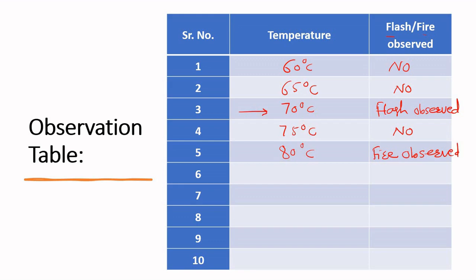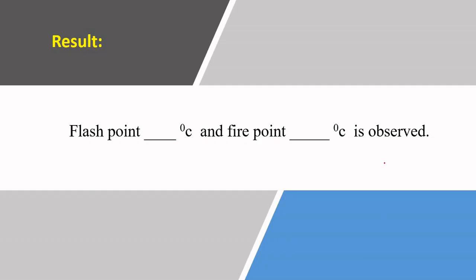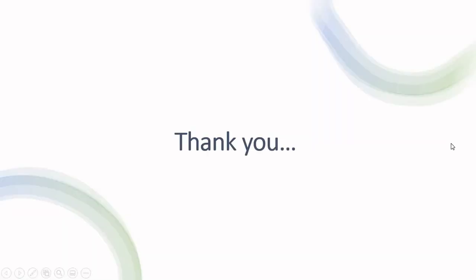This observation gives information about the flash point and fire point: the flash point is 70 degrees Celsius, because a momentary flash is observed at 70 degrees Celsius, and the fire point is 80 degrees Celsius, where the vapours of lubricant oil catch fire and burn for about 5 seconds. The flash point is 70 degrees Celsius and the fire point is 80 degrees Celsius. In this way we have determined the flash point and fire point using the Pensky-Martens apparatus for a given lubricant oil. Thank you.